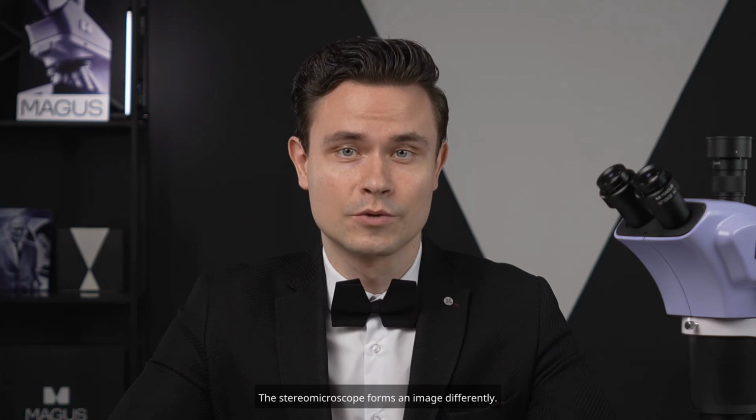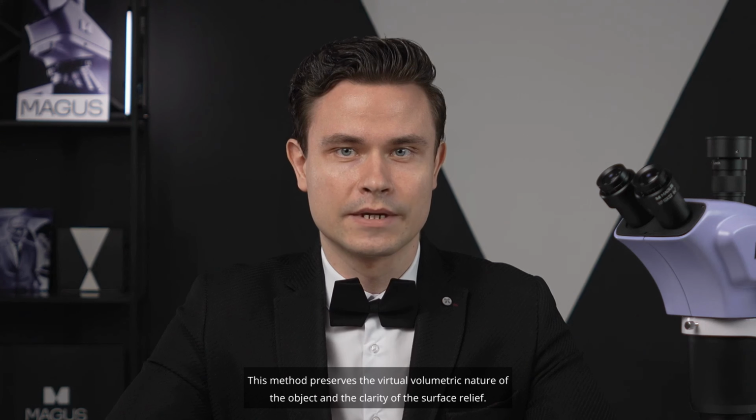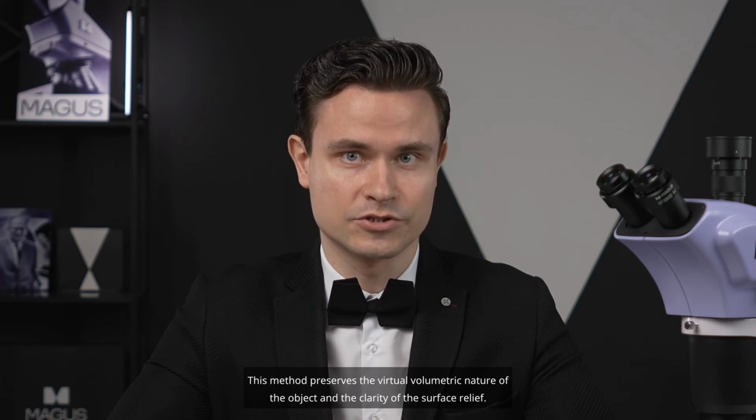The stereomicroscope forms an image differently. The objective part creates an enlarged image of the object from two sides at a stereoscopic angle of 11 or 15 degrees. Different images enter the eyepieces, with each eyepiece magnifying its own. As a result, we obtain two different images of the object in the left and right eyepieces. This method preserves the virtual volumetric nature of the object and the clarity of the surface relief.